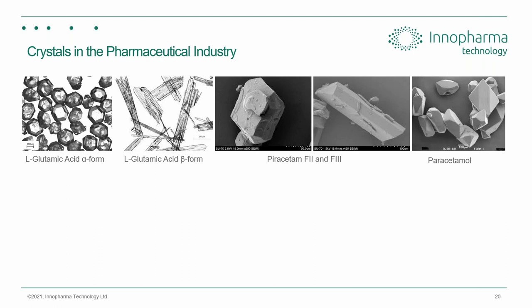So these compounds are synthesized as pure crystals before being crushed and blended and milled and all sorts of post-processing in order to make sure that these crystals are evenly distributed throughout the tablet, so that they can also be evenly distributed and/or target specific parts of the body.